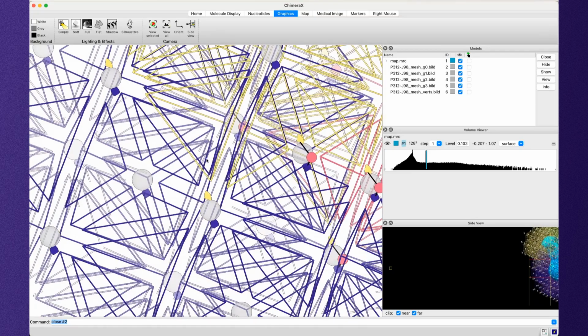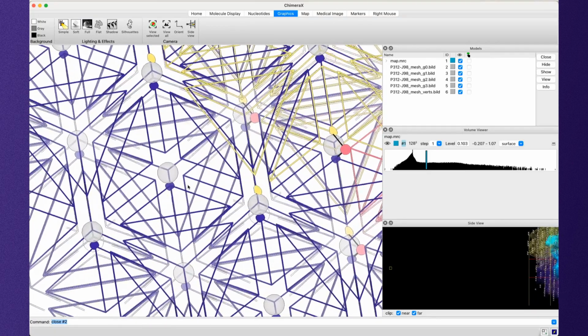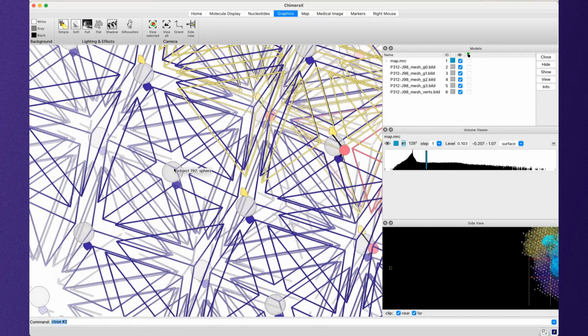If we want to compress just the yellow tetrahedron, but not this blue or purple tetrahedron, then we can move just the yellow copy of this vertex and leave the blue one here. And that is very different from what happens when we have this blue vertex over here, right? This one has to move all of the tetrahedra that are touching it, whereas this is actually two different ones. We can move the yellow and blue meshes independently.